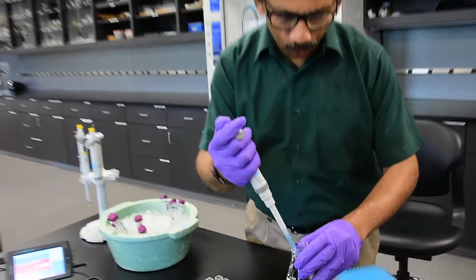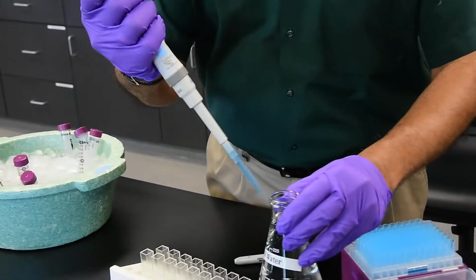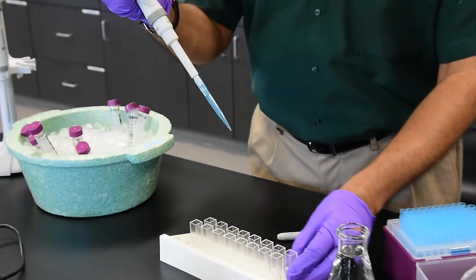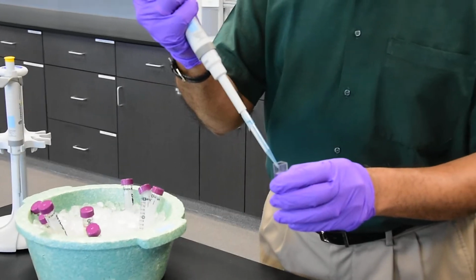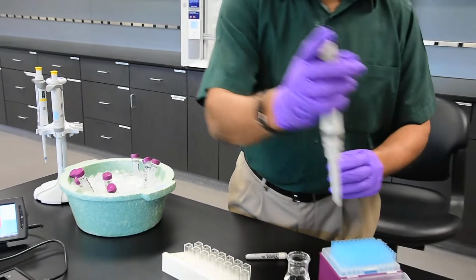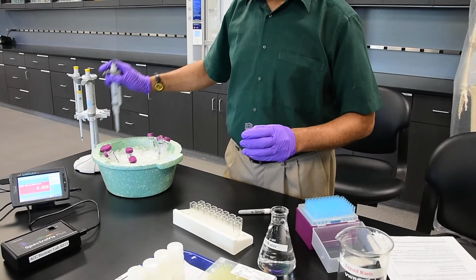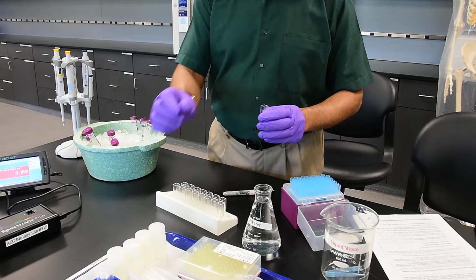So this is how you do the dilution. 1 part enzyme, 1 part of water. So now the concentration becomes half, the dilution becomes twice or 2x. So now I mix the two together, I discard the tip, I put the micropipetter back on the stand, and that also avoids any contamination.